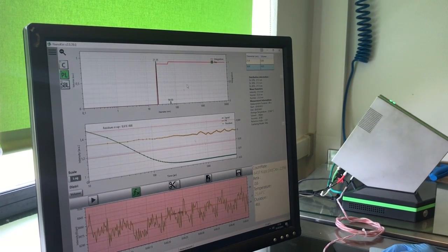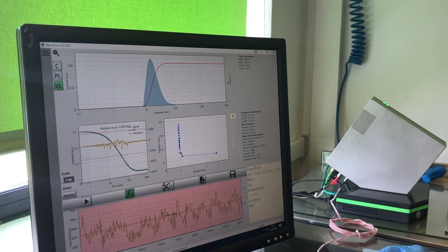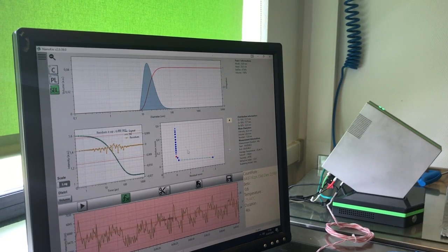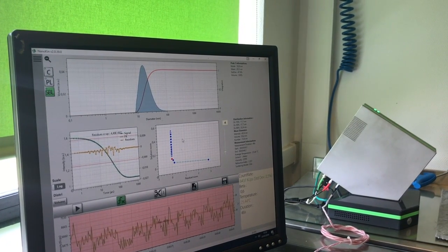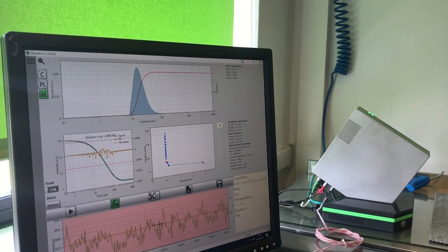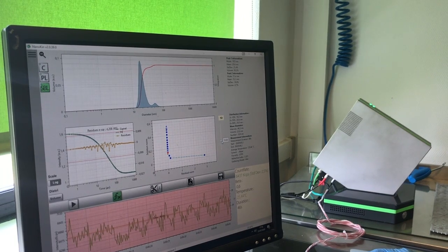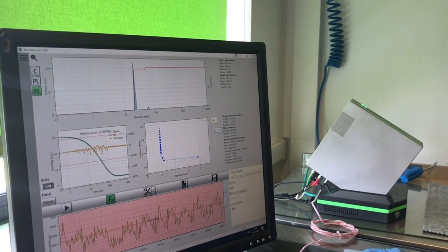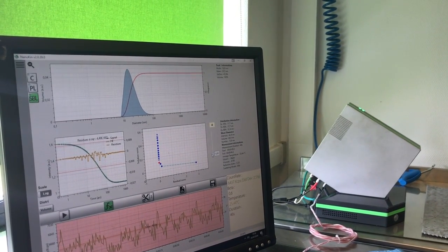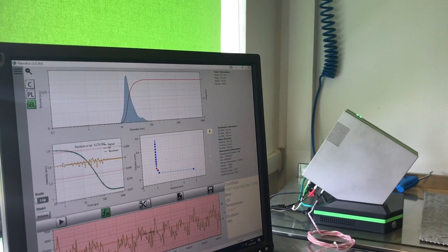You will see approximately the same kind of information in Padé-Laplace. In SBL, you have something more. It's called the L curve that you have here. The L curve gives the different possible solutions with this kind of signal. To summarize, you have a parameter here that you can change, in which you can see different shapes of the distributions and see the corresponding residue of the solution.